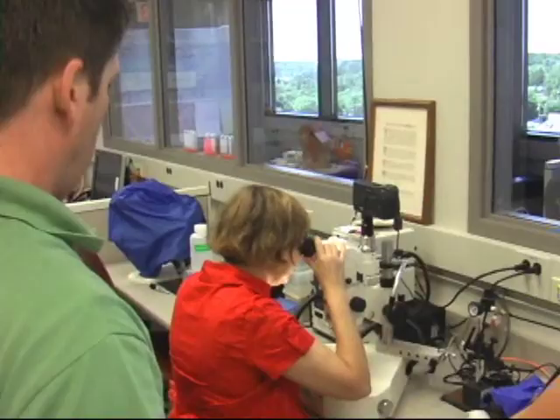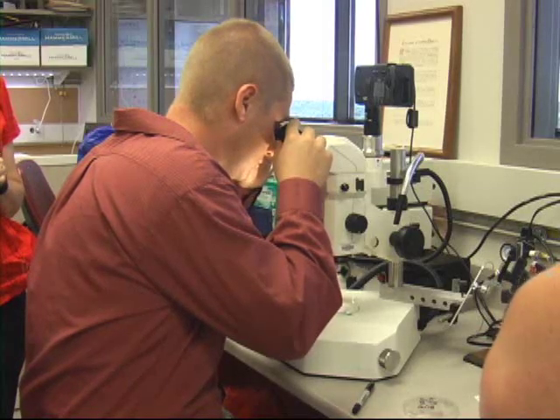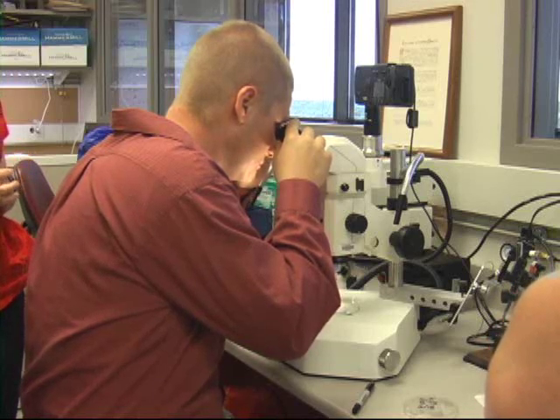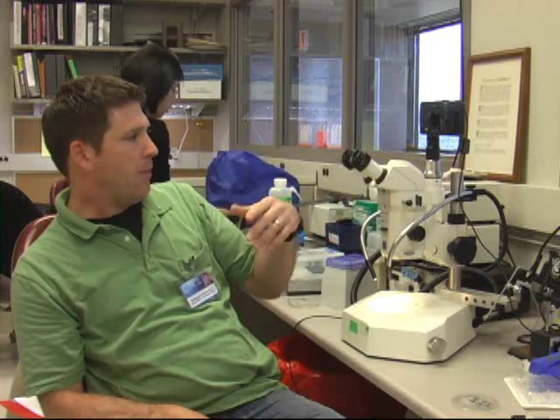I swear to you, 99.9% of doing science is sense memory — it's getting your hands where they need to be, your elbows where they need to be. Lots of scopes have a switch from the optic to some other tube that might feed to a computer or a camera.